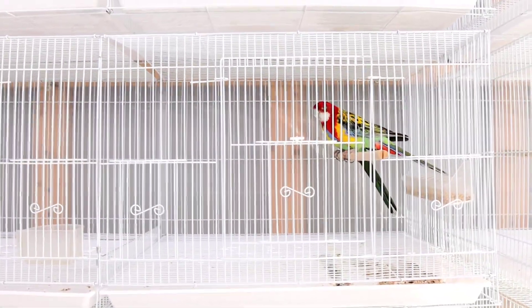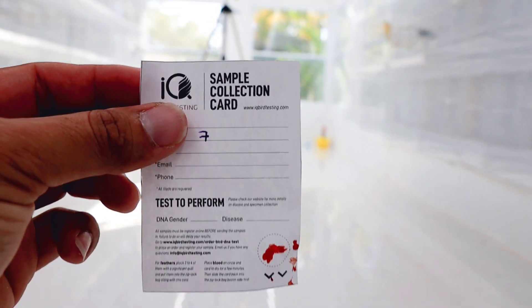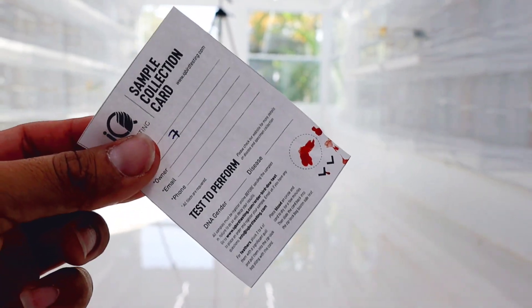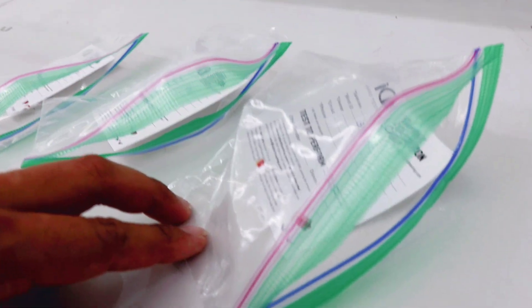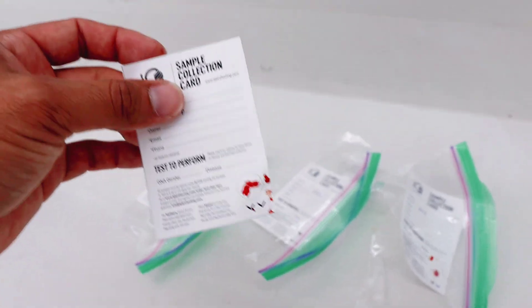We got all the blood samples we needed from the pairs — here they are. After you put them back in the cage, look at the perches they're standing on. If there's blood on the perches, pull the bird back out and apply more bleeding stop. One last thing: once you get the blood on the sample card, wait a little bit for it to dry. The last thing you want is to put a wet sample into the Ziploc bag. I made that mistake — the blood was still wet and smeared onto the bag. So make sure it dries first, then put it in the Ziploc bag.